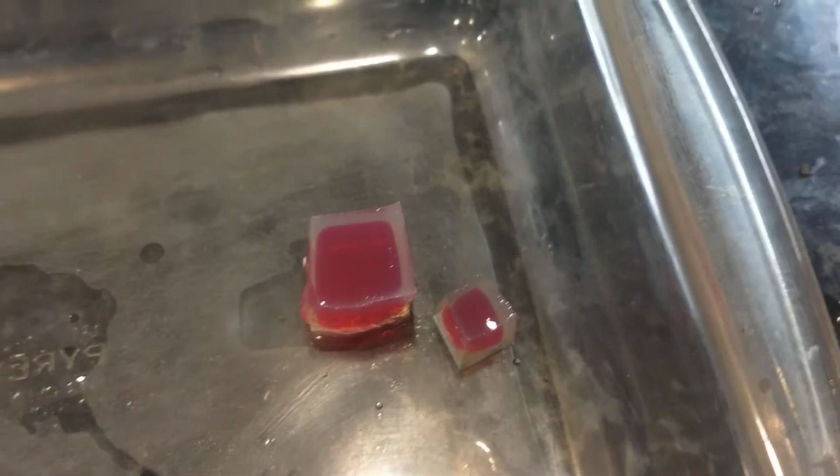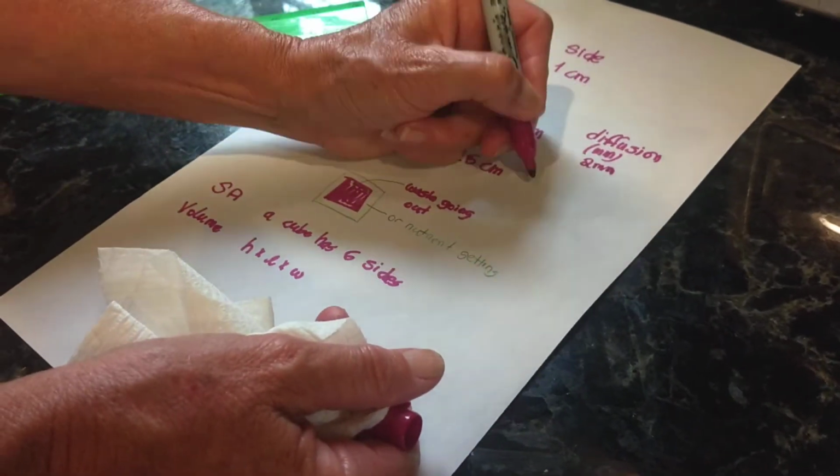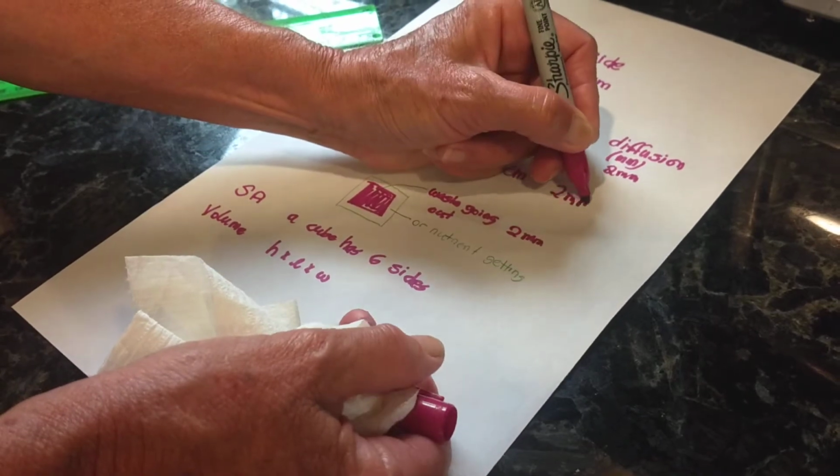And we do the other cube here, the middle cube. And it's about 2 millimeters. And the larger one here, also about 2 millimeters. Real quick, you're going to put the towel so I'm not slimy. Okay, so the diffusion for all the cubes. Okay, so it's 2 millimeters, 2 millimeters, 2 millimeters. Okay, I'll hold this out too so you guys can see here.